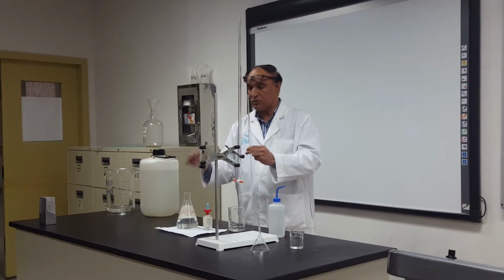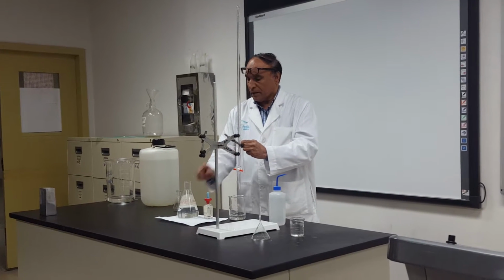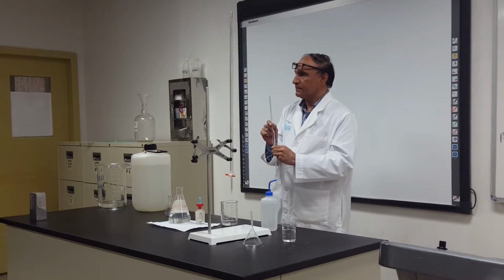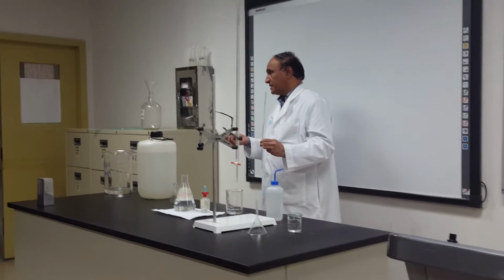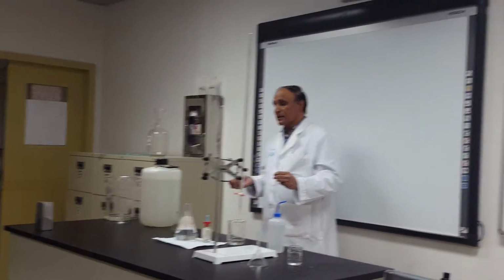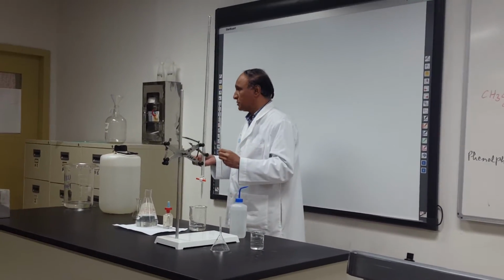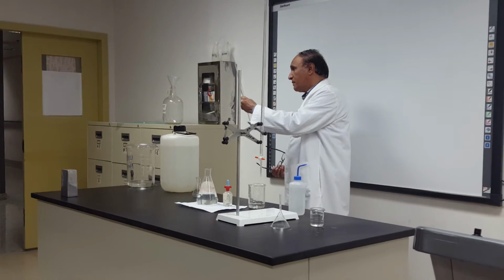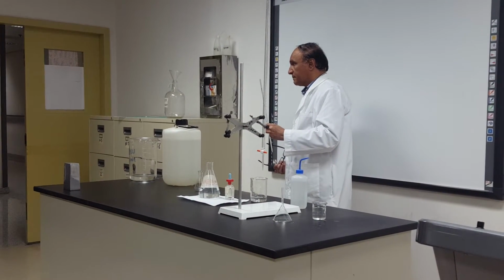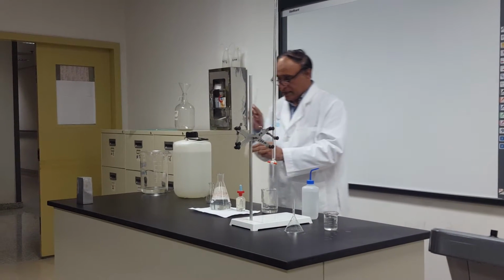And now these two things are ready. I will take vinegar into here. Vinegar is not dangerous. It's halal. You are taking it. Similarly, if there is water, we can take with this one. If there is glucose solution, we can take. If there is Pepsi, we can take. Right? Because these things are not dangerous. So I have already washed it. I take this one.